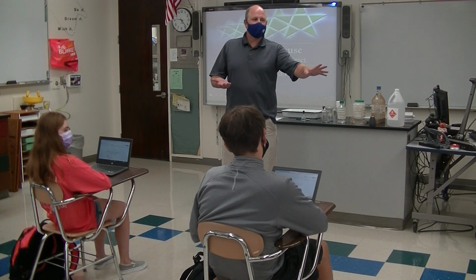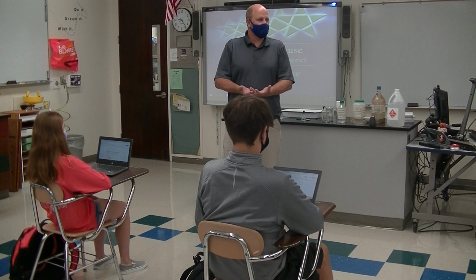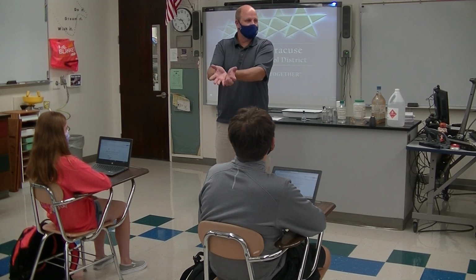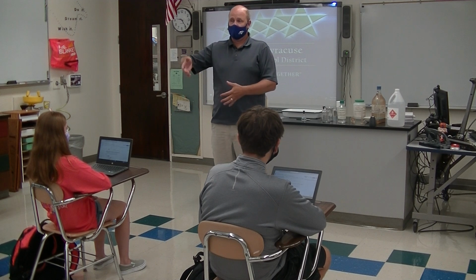All right, so if something's going to happen in the school, odds are it's going to happen in here. The most dangerous person to you in here is who? Maybe yourself, but there's someone even more dangerous: the person working next to you. Because if it's yourself, you're generally not going to spill things or break things on yourself, usually, right? But what are you going to do? You're going to throw it someplace else, or it's going to go someplace else. So I would normally say it's your lab partner, but I don't think we can have lab partners this year. So if there's somebody working in the near vicinity of you, that's the person who's the most dangerous person to you.